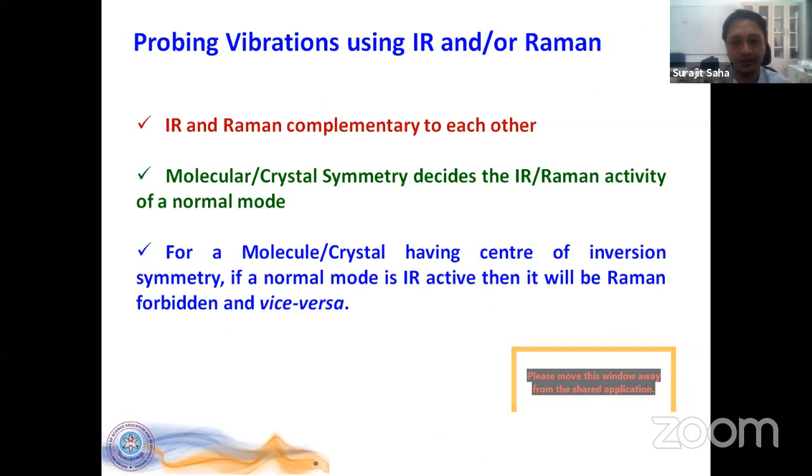Here I'm going to speak out a couple more points. Basically, as it is said, IR and Raman are complementary techniques. That means for any complete study, whatever information we get, Raman can always complement it, and vice versa. And it is the symmetry of the molecule or the crystal that decides what particular mode will be IR active or Raman active.